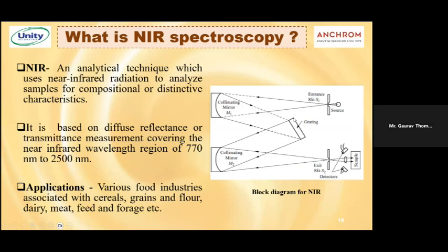Through this monochromatic grating, the selected wavelengths are made incident over your sample one by one. When your sample gets exposed to those radiations, it interacts with them. What kind of interaction happens when light interacts with any substance? Mostly it is reflection. And in some cases, when you have a clear, transparent or translucent sample, you have transflection happen. So that is what happens.